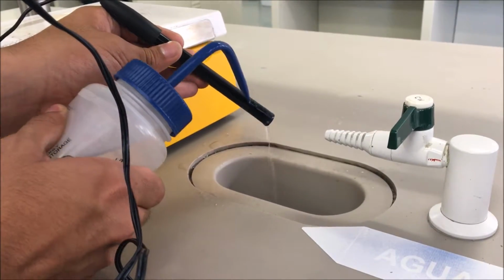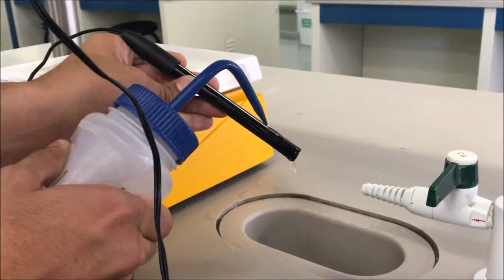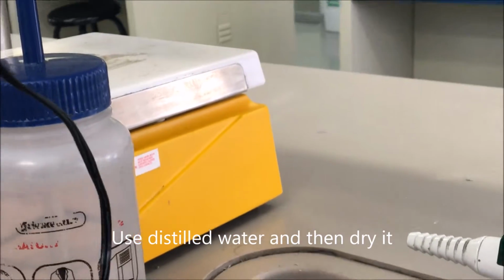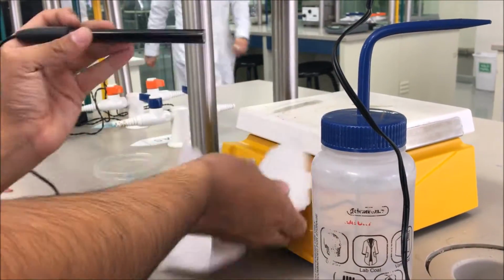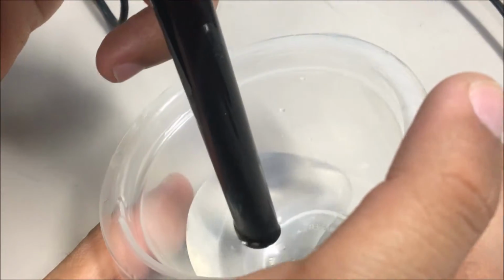Put the pH meter into one of the substances and wait until it stabilizes. After registering the results, you must clean the pH meter with distilled water and dry it. Now repeat with each substance and register the results. Remember, you should always clean the pH meter after each substance.